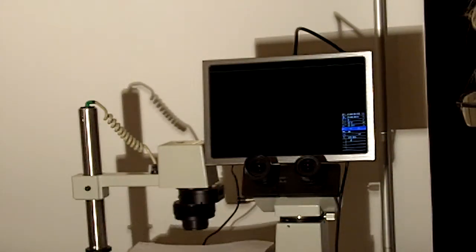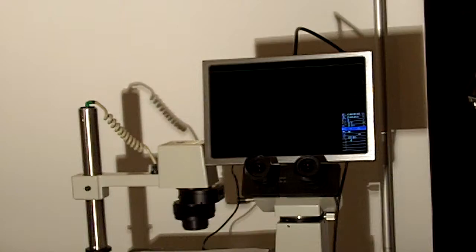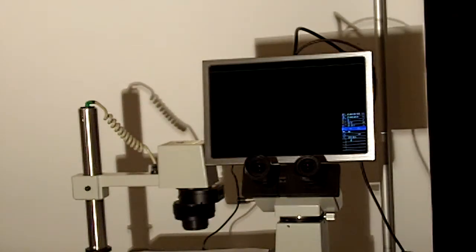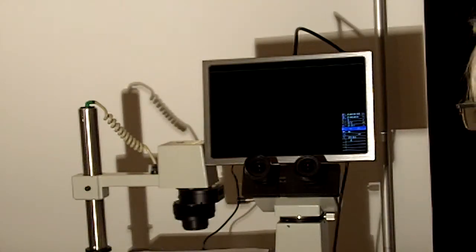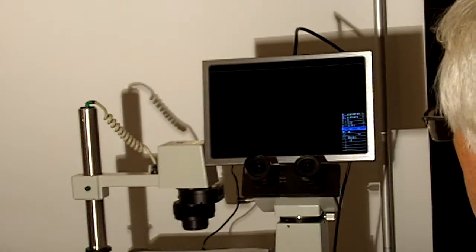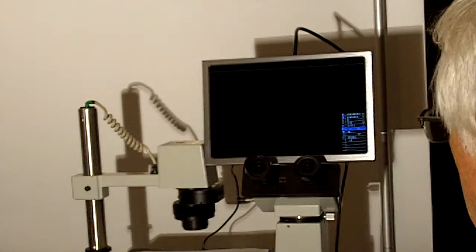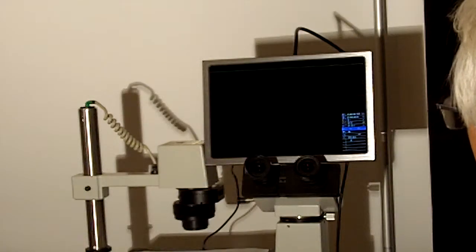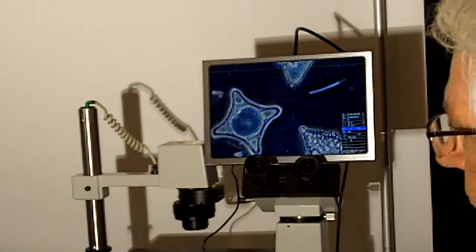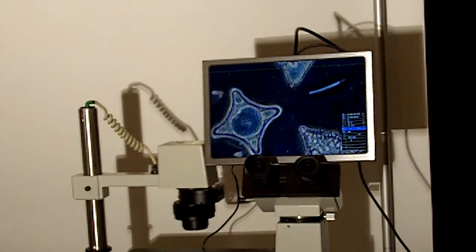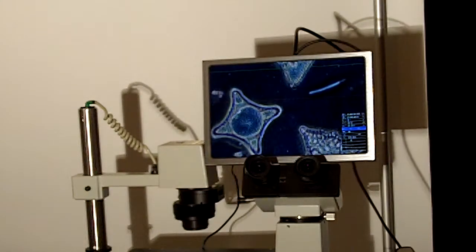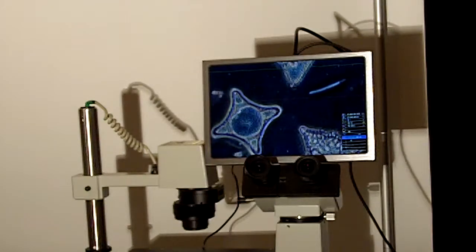We have the ability to do white balancing. We can put in a white screen, go to the white balance mode, and let it white balance itself. There's also an auto exposure mode.